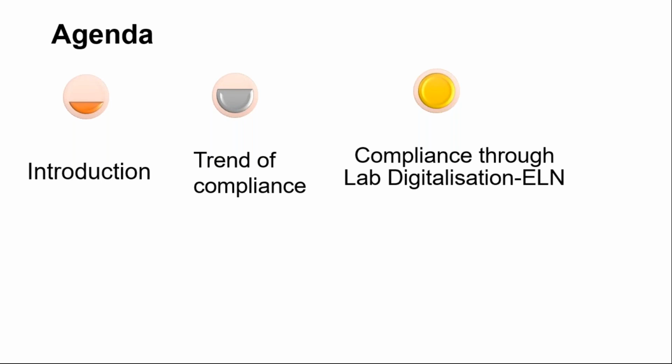So today we're going to cover the trend of compliance in the area of research data, and how we can accomplish this compliance through lab digitalization, and specifically through implementation of an electronic notebook.